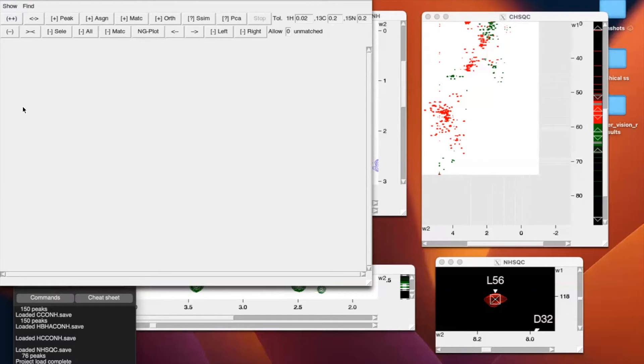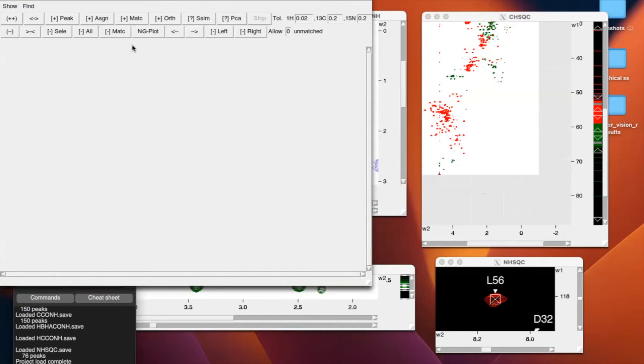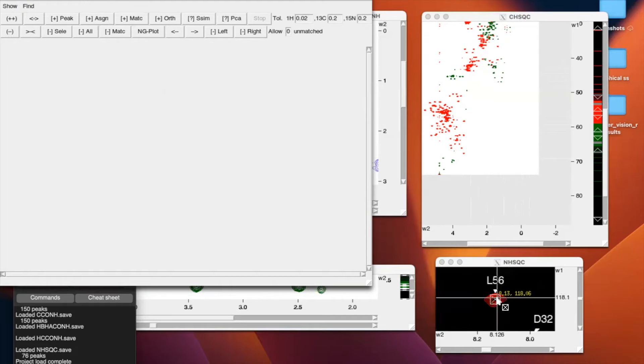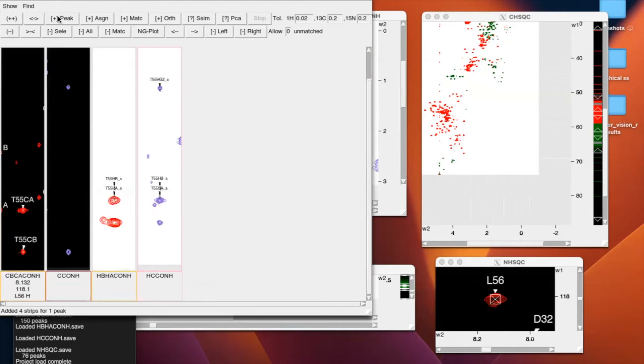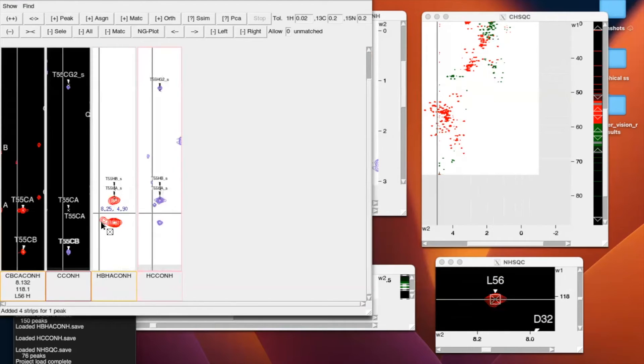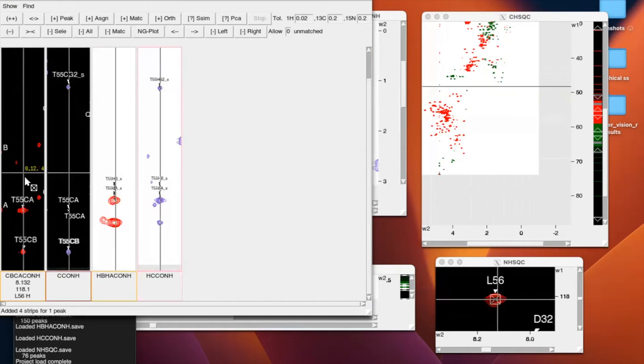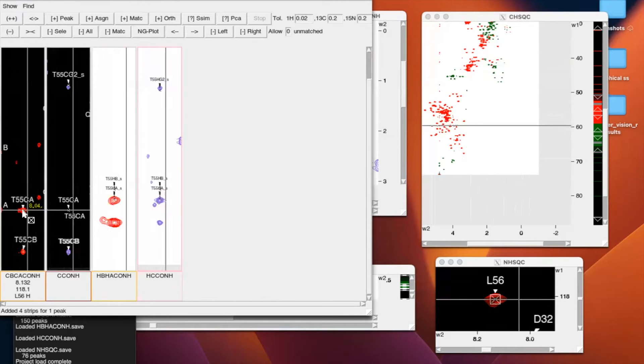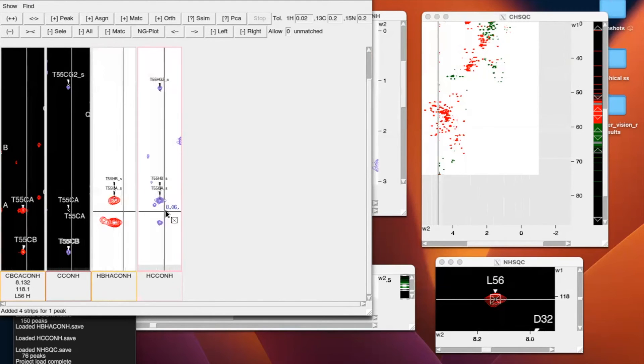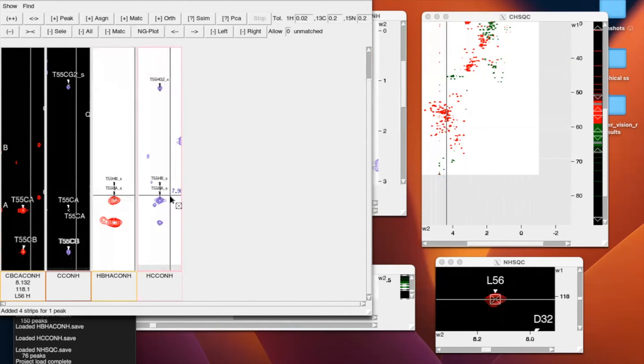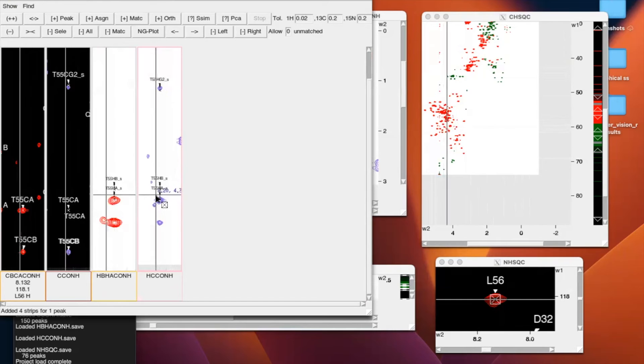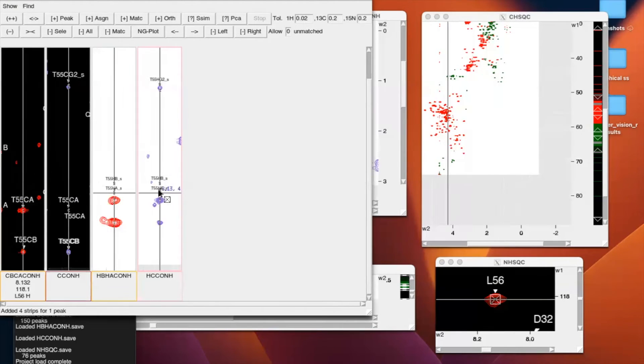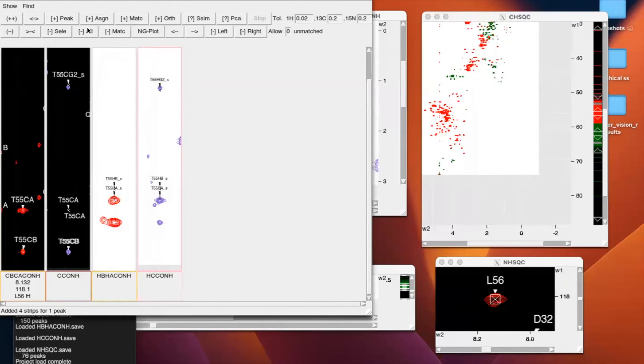So now that we've done that, it's important to note that when we select a peak from our NHSQC to load all of that spectra onto our strip plot, it's going to go from the aliphatic carbons of the previous residue to the amide proton residue the following. So if I do L-56 and I add that peak, we're going to see the aliphatic carbons of T-55 to the amide protons of the 56.